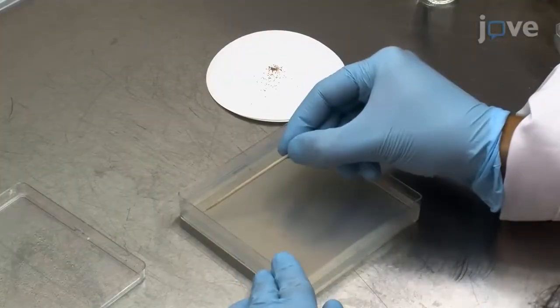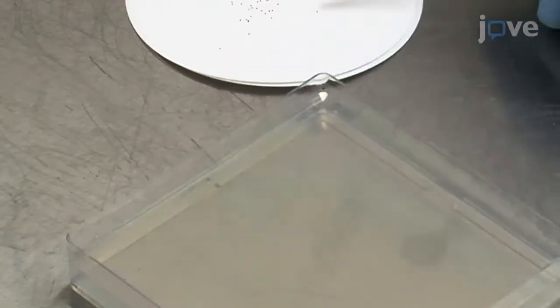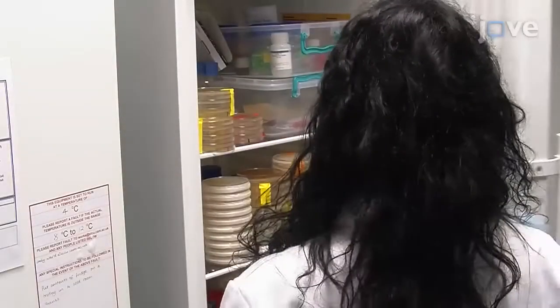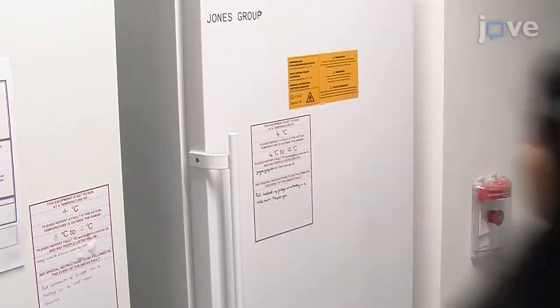Begin by sowing approximately 20 sterilized Arabidopsis seeds on 1/2 Murashige and Skoog, or MS, agar square plates. Seal the plates with porous surgical tape and wrap them with aluminum foil for 1 to 3 days of incubation at 4 degrees Celsius for stratification.